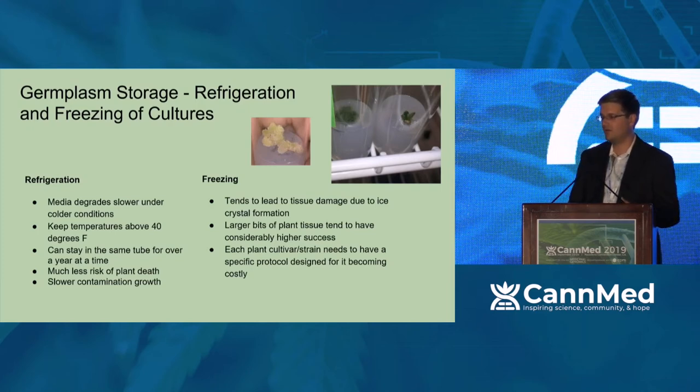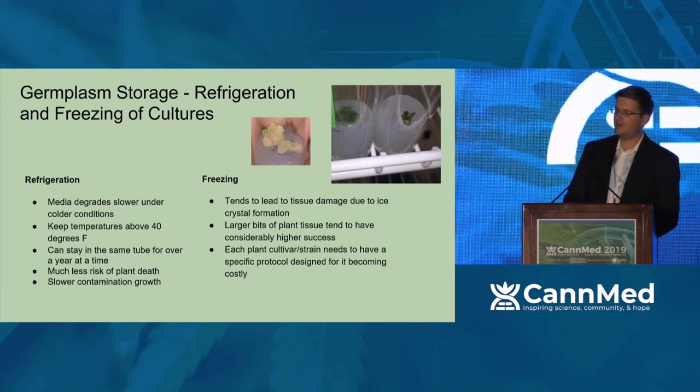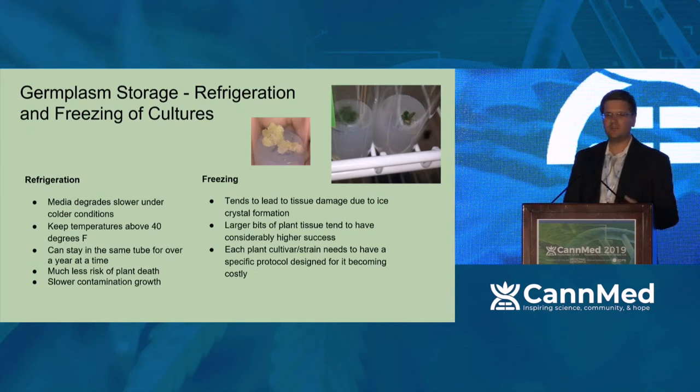lab or better. The other one that a lot of people ask is, can you freeze these cultures, cryopreserve them, that sort of stuff. I have actually never personally tried cryopreserving cannabis tissue culture, but what I have found in all the literature is there are all sorts of issues with either freezing or thawing that cause the vacuoles to burst, and that causes a lot more problems in the long term for even trying this out. So whenever I'm starting somebody out in a lab, I just recommend they go room temperature, no more than refrigerator, and just work with that.